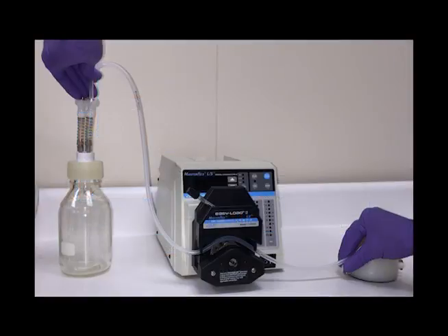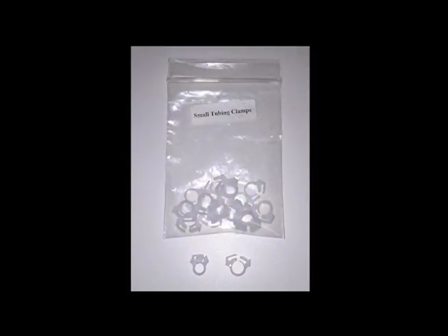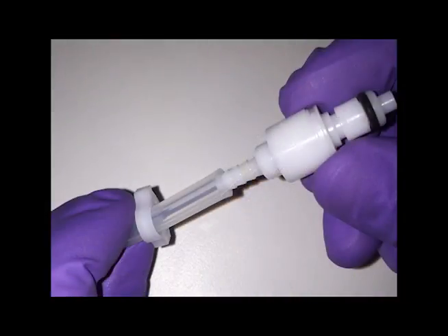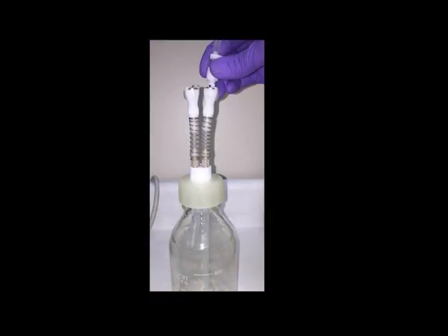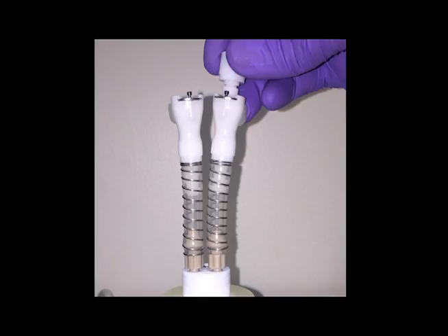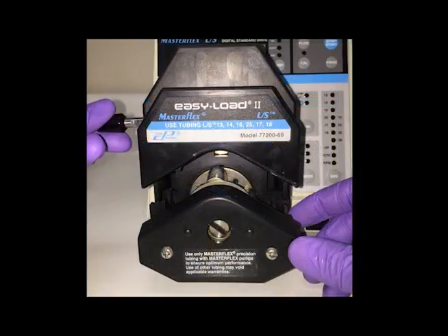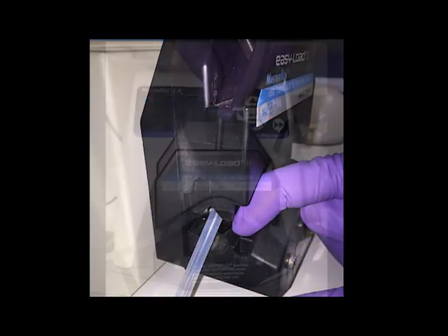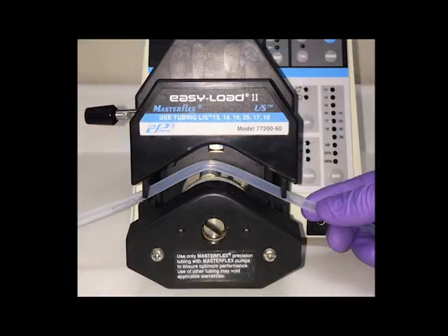First, determine how much tubing you will need to go from the outlet of the medium collection bottle through the pump to the first pulse dampener and cut this length of tubing. Slide a small tubing clamp onto the free end of the tubing and insert the barbed end of a male quick disconnect into the tubing. Pinch the clamp to tighten the tubing over the barbed end of the quick disconnect. Connect this quick disconnect to the outlet quick disconnect on the media collection bottle. Place the middle segment of the tubing into the pump head. Rotate the lever to the left to open the pump head for tubing placement, then rotate the lever to the right to secure the tubing. When not doing an experiment, the pump head lever should be rotated to the left to eliminate pressure on the tubing.